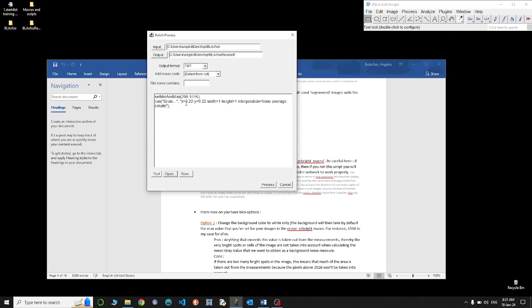So this is the scale that I use. It's 0.22, so it will be practically smaller than it was, and that's what I want. I want to downscale it. And this is the minimum display value, and this is the maximum pixel display value.